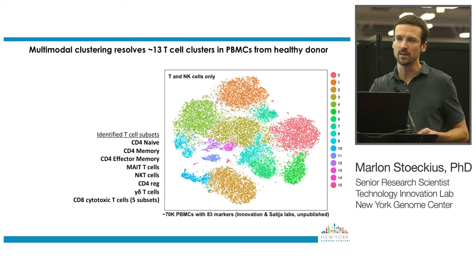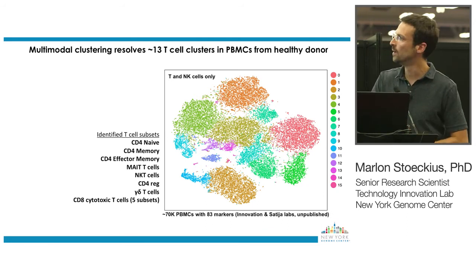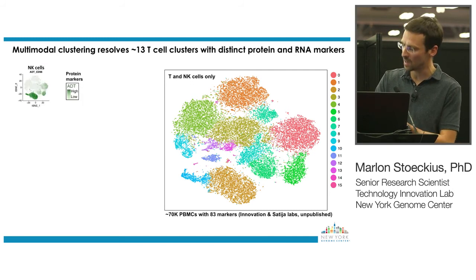We essentially see all T cell clusters that are known and described in a healthy individual. And that's just now a few different markers. For example, NK cells.